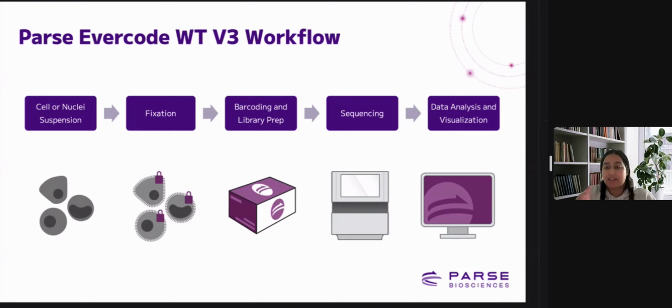After that, each of these fixed cells, in order to ensure diversity and to make sure that each cell follows its own path, and like that we can increase the number of combinations of barcodes that each one is labeled with. We will run through 3 rounds of barcoding, and of course we'll meet again when we're ready for barcoding, and I can always come and run barcoding with you guys.